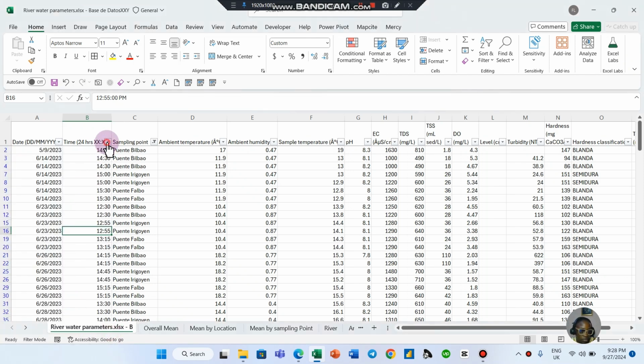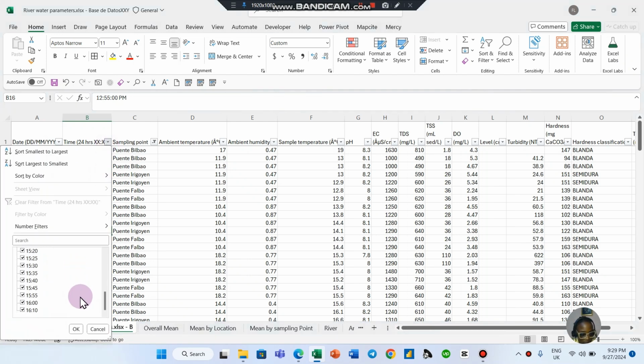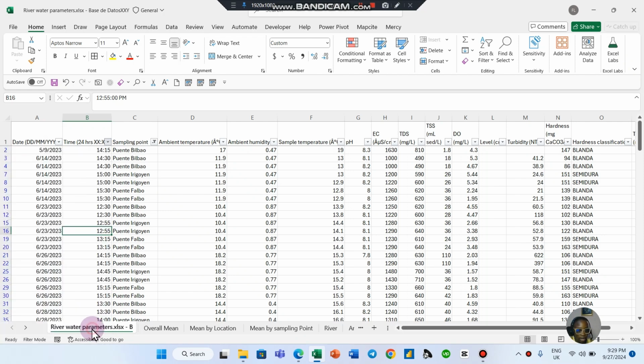We even have time, so we might want to know if the variables are based on time of the day, if there is seasonality during the day. Maybe the temperature is different in the afternoon, like there's a significant difference over morning, afternoon, evening. So you can look at the research from different angles. This is how you can deal with this analysis using Microsoft Excel.